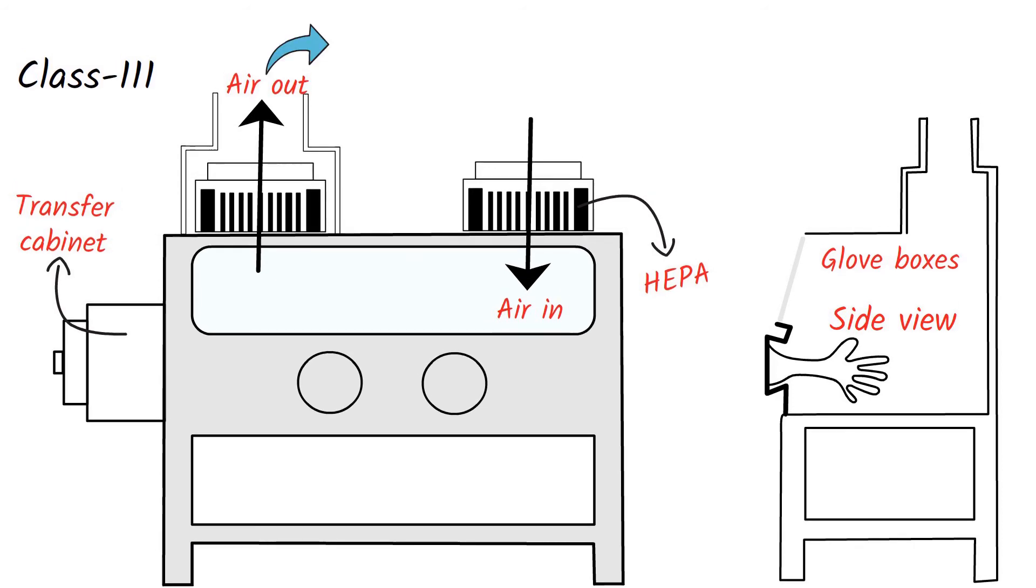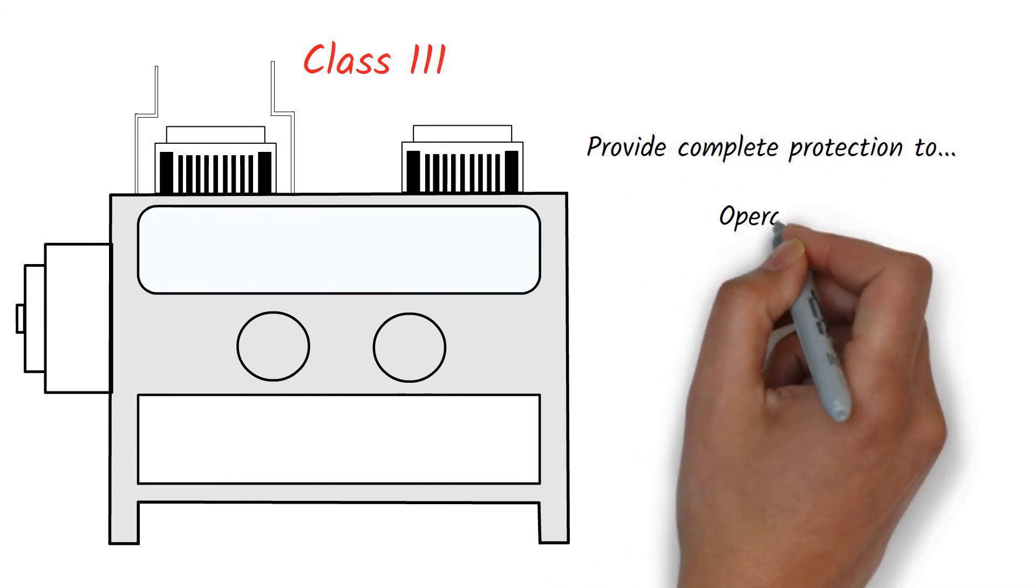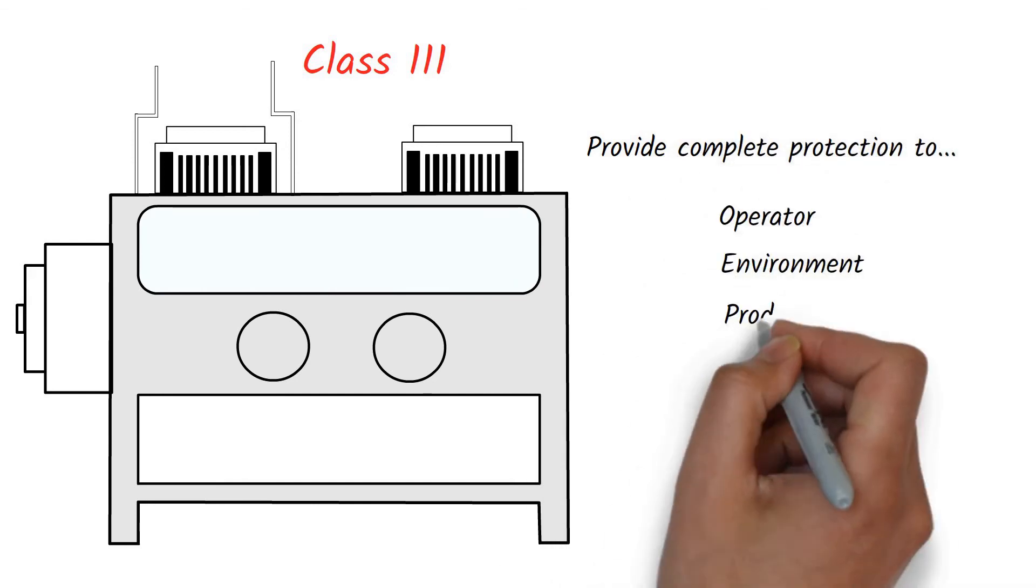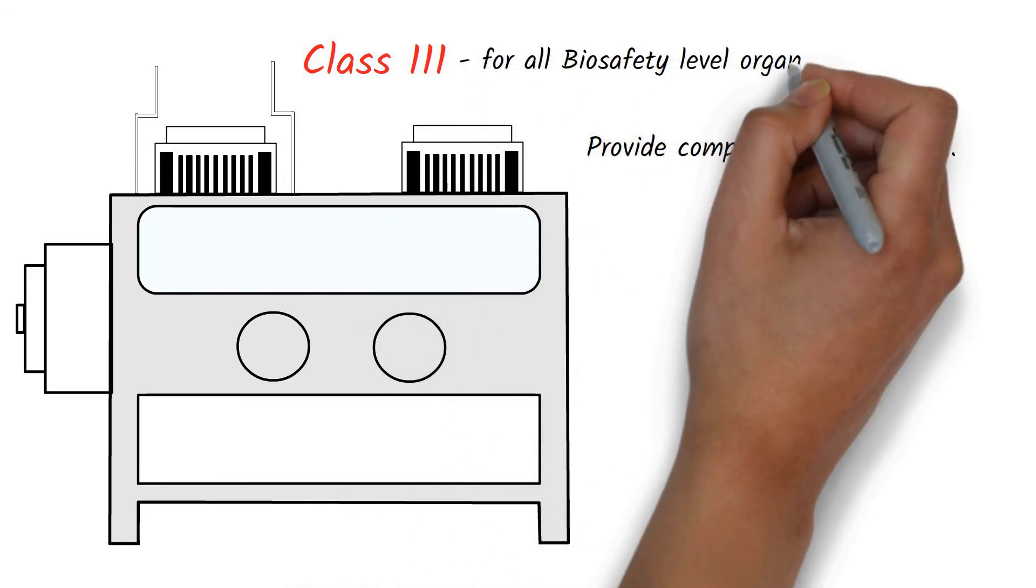The exhaust air is either treated with double HEPA filters or single HEPA filter followed by incineration. The Class 3 biosafety cabinets provide complete protection to the operator, environment, and the product. Hence, the Class 3 is suitable for all biosafety level organisms.